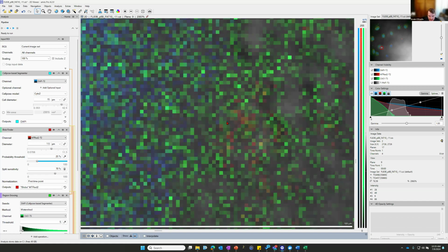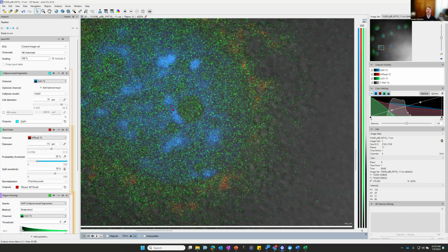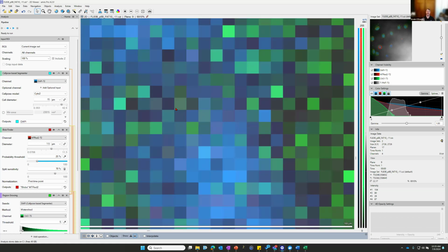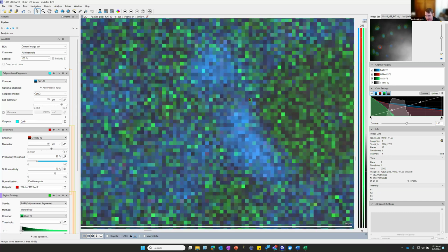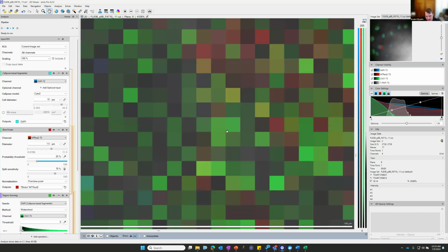But we can zoom into and see the actual pixels themselves. And this is really useful for when you're trying to segment objects out. It can be kind of annoying if you don't have the best resolution or whatever. It's kind of easy, I think, to have access and visibility of the individual pixels.